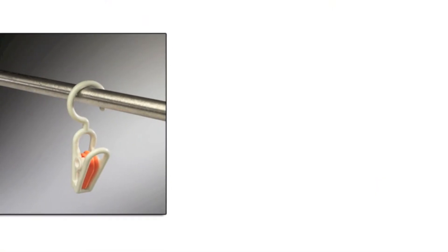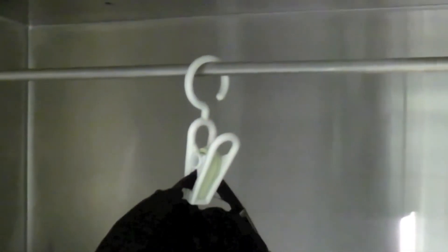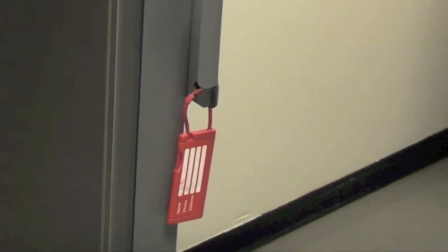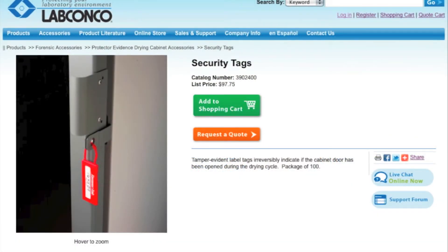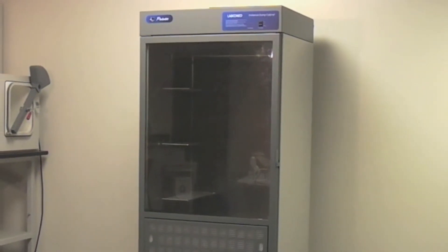LabConco offers a complete line of accessories for Protector Evidence Drying Cabinets. A starter kit is available that includes replacement pre-filters, hanging clips, security tags, paper liners, and germicidal cleaners. All of these products can be ordered separately as well. Other accessories include a drain kit and exhaust connection kit for a hard ducted installation.